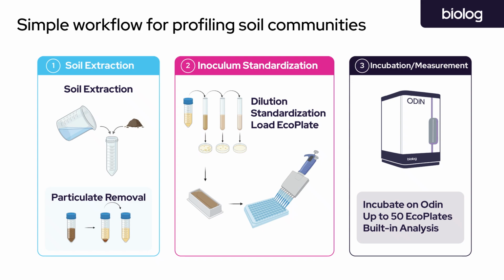And what we're gonna do here with the soil is we're gonna start by preparing a soil suspension with your preferred buffer. I always recommend you start with a buffer and don't just use water. There's some osmotic effects that you can avoid by using a buffer, and so it is very important that you start with a buffer. Dispersing then your microbes from the soil particulates and removing the debris. So this is the first step that we call here soil extraction.